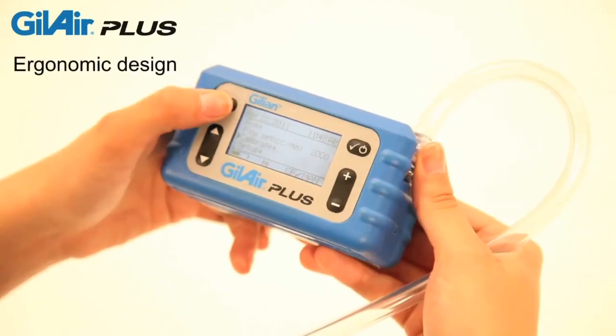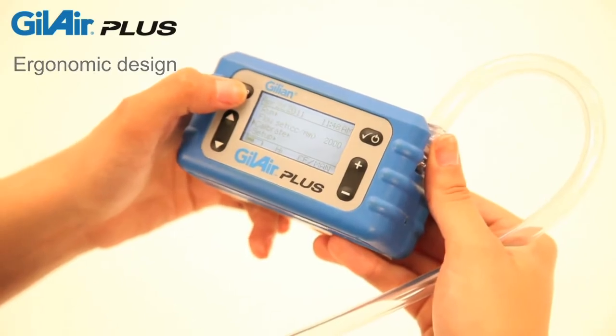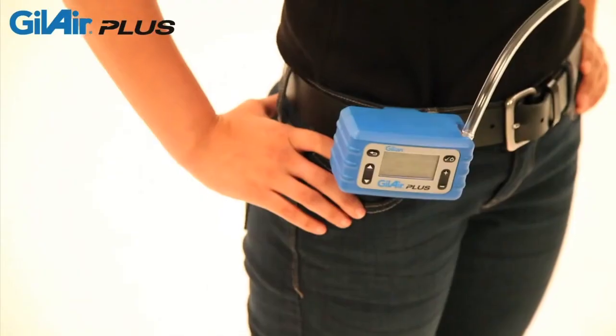With an ergonomic design one-third smaller than traditional personal air sampling pumps, quiet operation, and weighing less than 21 ounces, GillAir Plus is comfortable to wear and easy to operate.